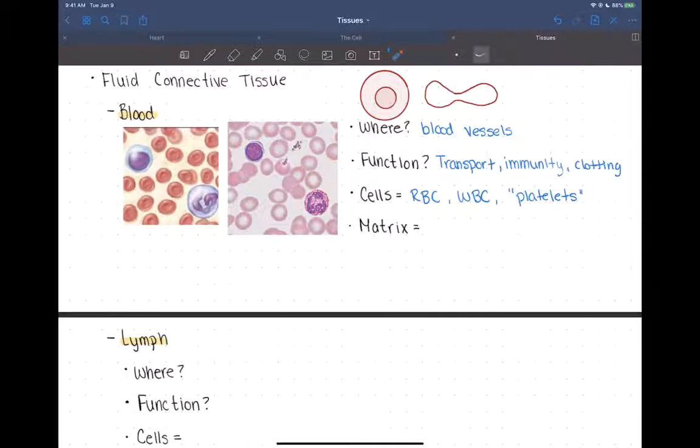They're the most common cells in blood. Then if you see a cell like this, slightly larger, with a definite nucleus, like this one that has many different lobes, that's a white blood cell. White blood cells have a nucleus; red blood cells do not. And then scattered here, these would possibly be little platelets. They're just little bitty cell fragments. They almost look like dirt when you're looking at a slide.